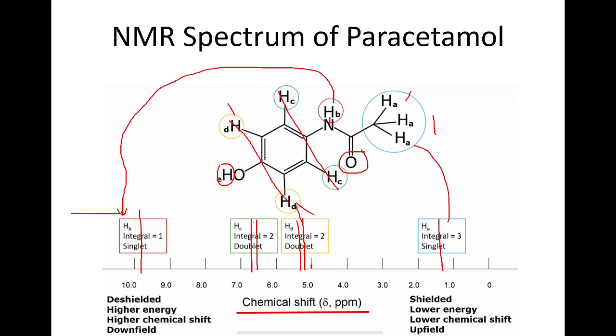So it might be somewhere here or somewhere there. I think because it's close to the benzene ring and is directly linked to the oxygen, we might get it somewhere here. Not sure. But how many neighbors are there? No neighbor, so we just get one singlet for E. So that is what we get.